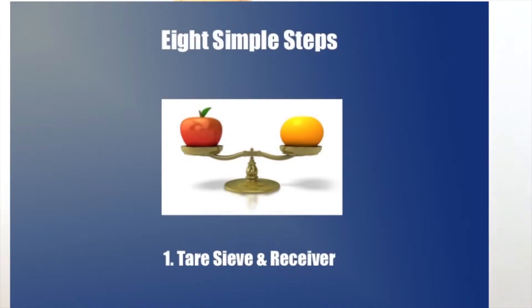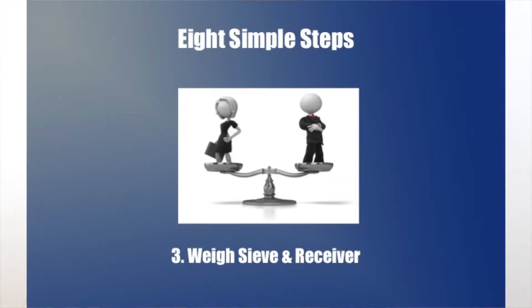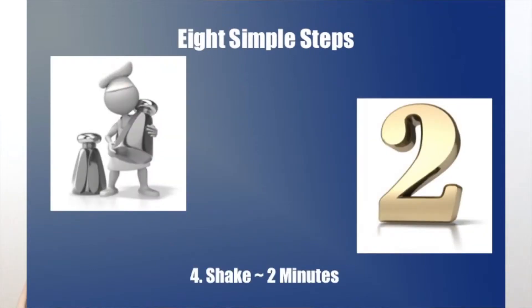The steps are straightforward. The sieve to be calibrated and a receiver pan are tared on a balance. A vial of calibrated spheres is added to the sieve, and the sieve and receiver are weighed and then shaken for about two minutes.